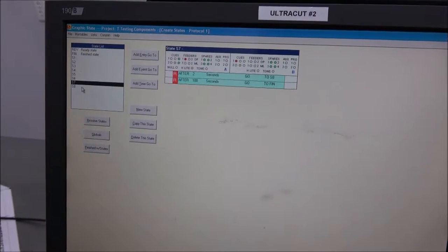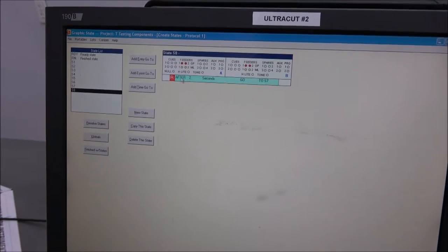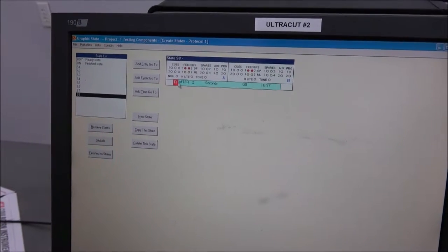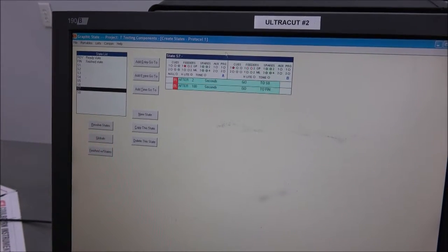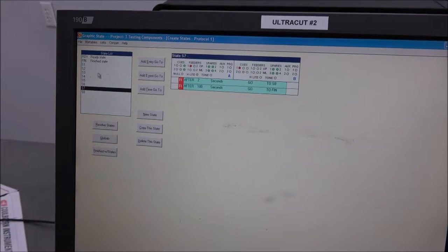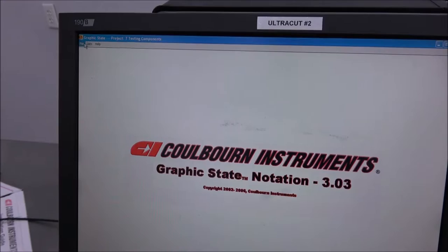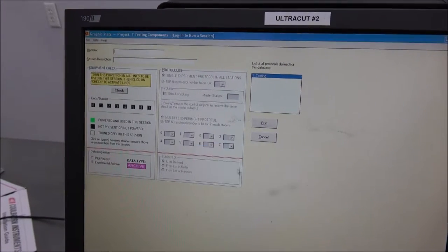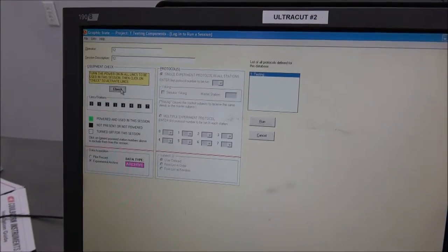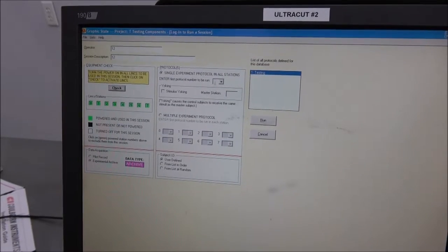Then it's going to go to eight. I'll go to eight and it's just going to run the feeder for two seconds. Then it's going back to seven, and it's just going to go back and forth. So we'll go ahead and show you that running. I'm going to run a session. Check, make sure everything's there.